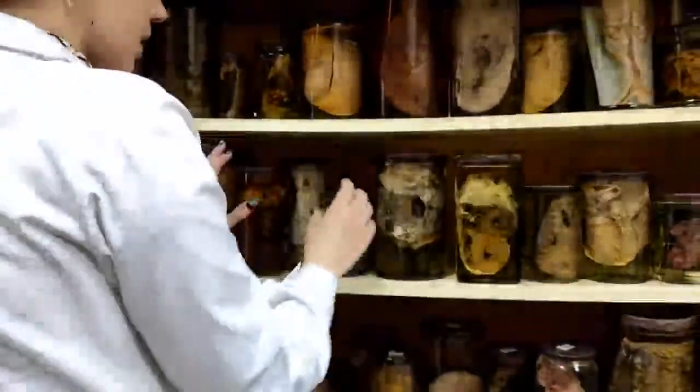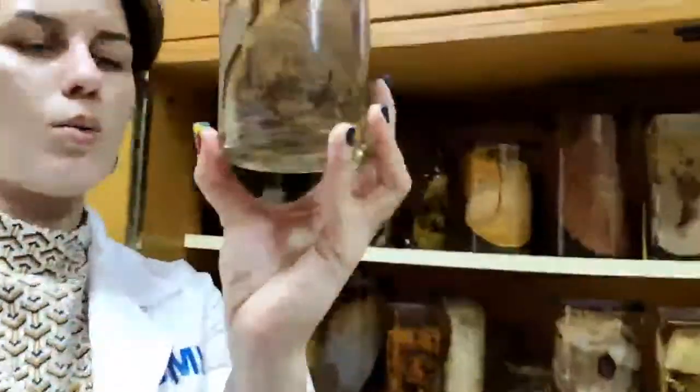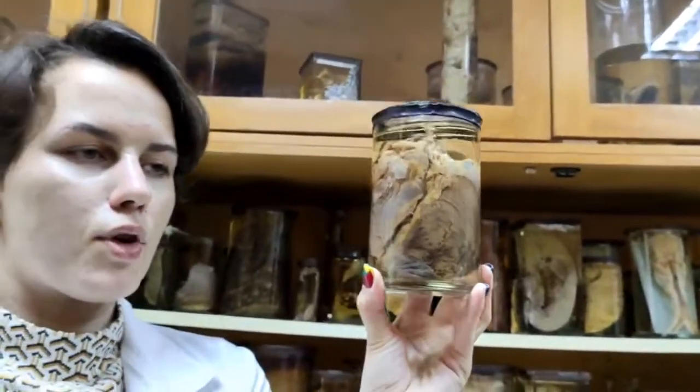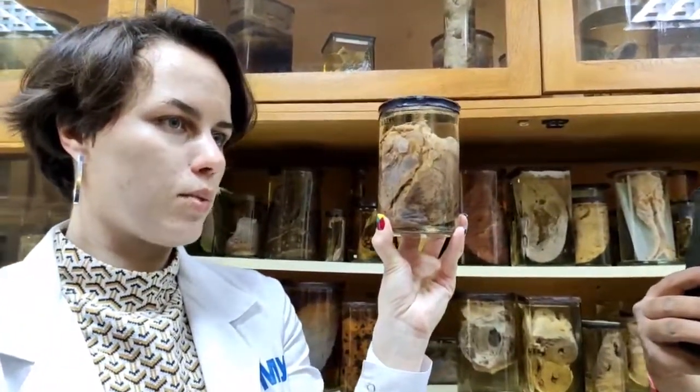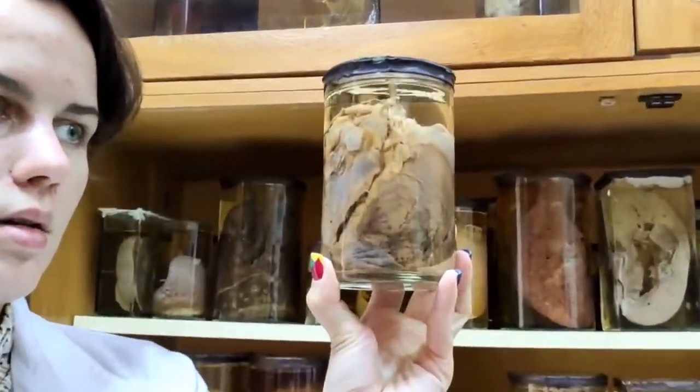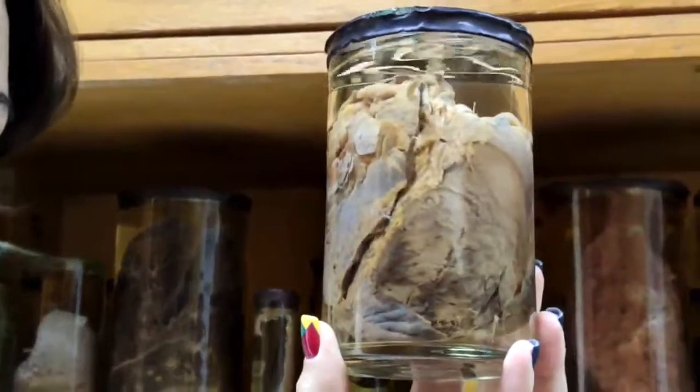The next one is myocardial infarction. First of all, I will ask you about the definition of infarction. Definition of infarction is really simple. It's ischemic necrosis. It's necrosis of the parenchyma due to ischemia. Very simple.